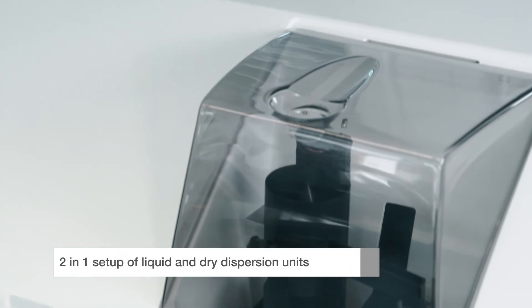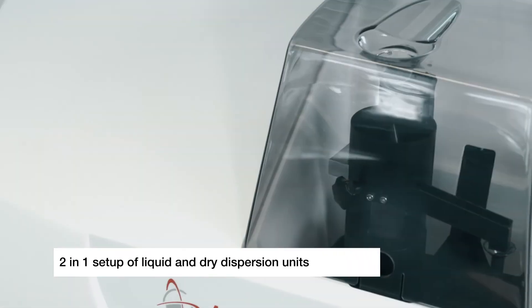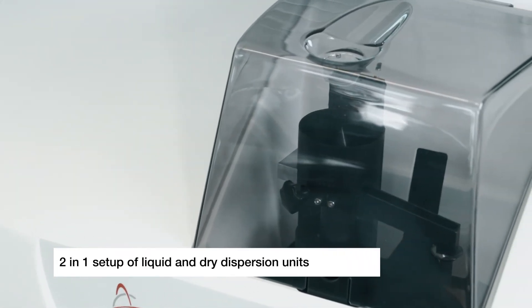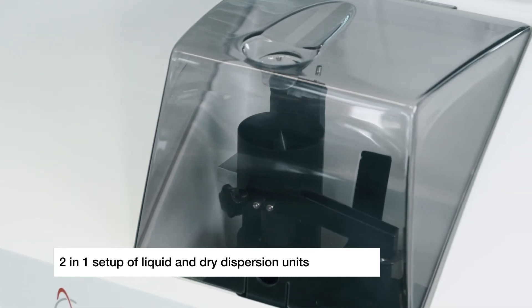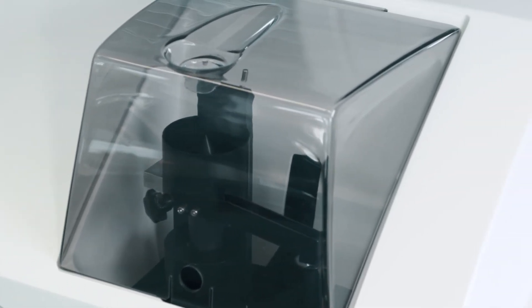To switch between a wet and a dry measurement, no instrument modification is needed. Both dispersion units are installed within the instrument and are ready to measure at any time, with the choice being done by a single mouse click.